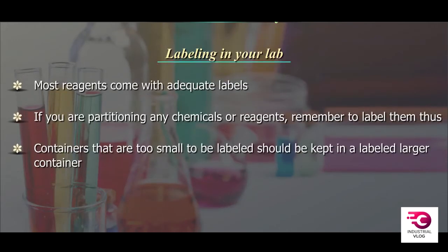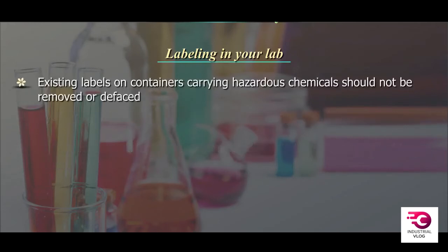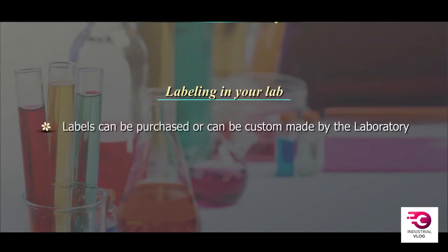Containers that are too small to be labeled should be kept in a large labeled container. Existing labels on containers carrying hazardous chemicals should not be removed or defaced. Date of preparation and/or the date placed in service and, where appropriate, the date of expiration wherever warranted. Unlabeled containers of chemicals should not be opened. Labels can be purchased or can be custom made by the laboratory.